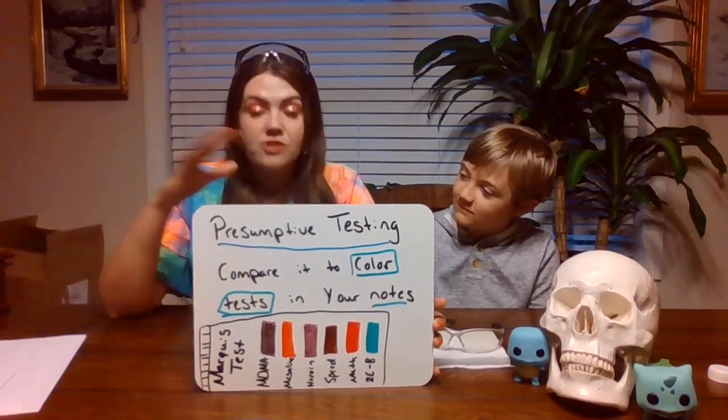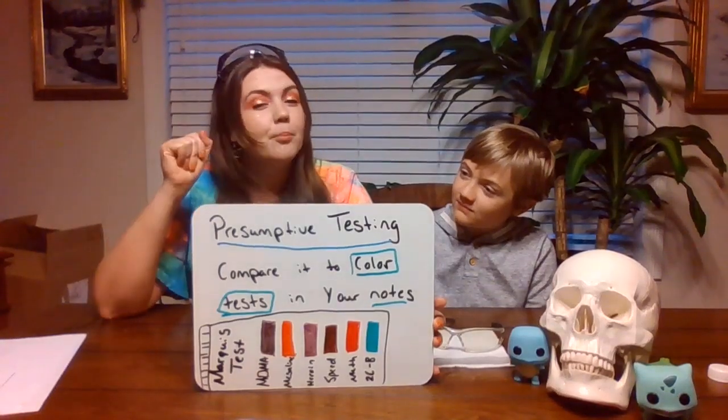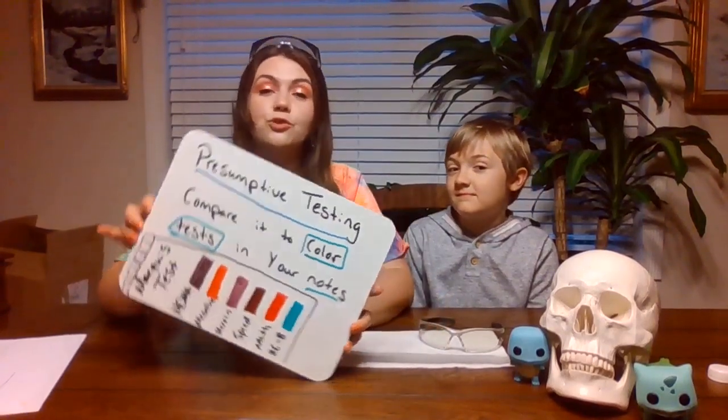But we're doing presumptive testing, which is usually just a quick, fast, cheap way to be like, I'm pretty sure that we're dealing with aspirin or we're dealing with cocaine, because you can test for illegal drugs as well.